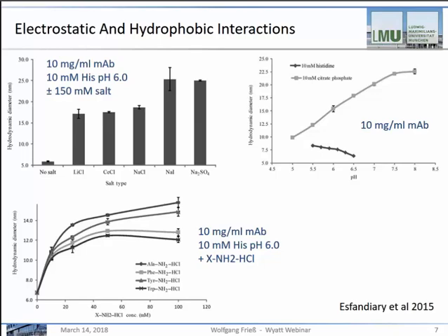You can envision that in the presence of salt, these must be large multimers if something is generated with a diameter of 16 to 20 nanometers. It is not necessarily related to the cation, as you see with the comparison of lithium and sodium, but the anion is more important, as you see with the effect of iodide and sulfate.